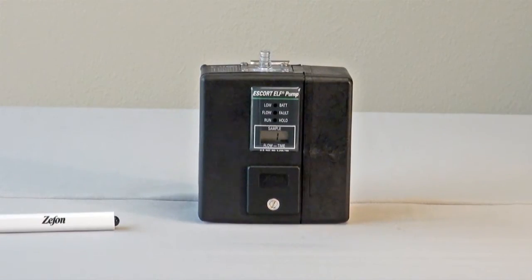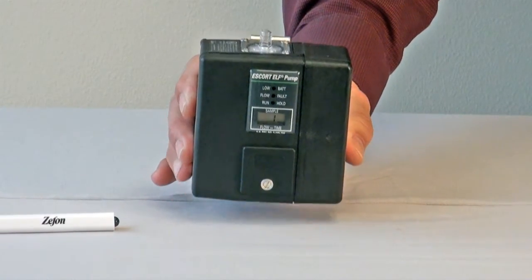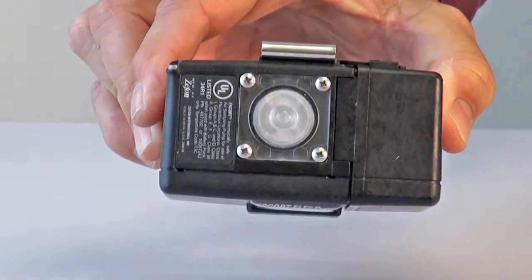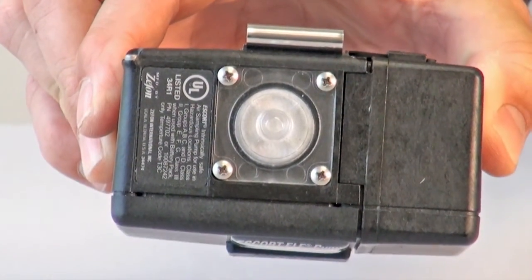Always remember, before turning on the pump, to check and make sure the inlet dust filter is not dirty or overloaded. Periodic replacement of the filters is necessary to maintain optimal performance. Please review the maintenance video for more details on how to replace the filter.